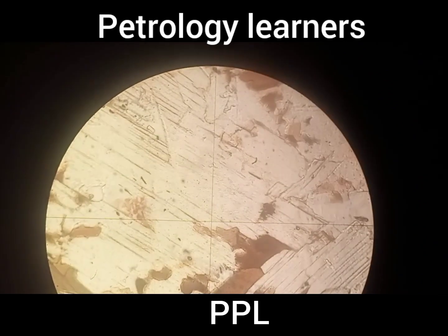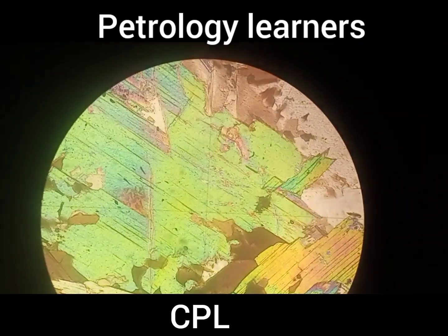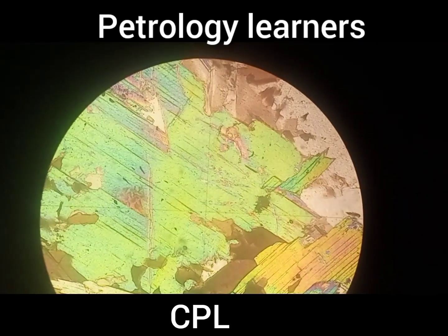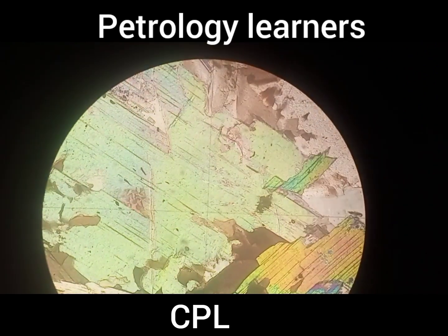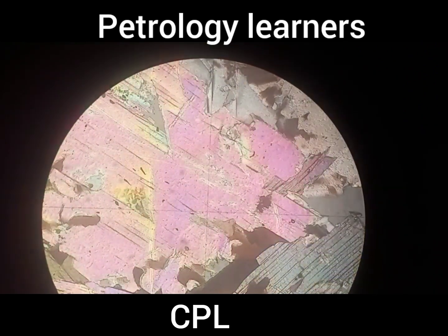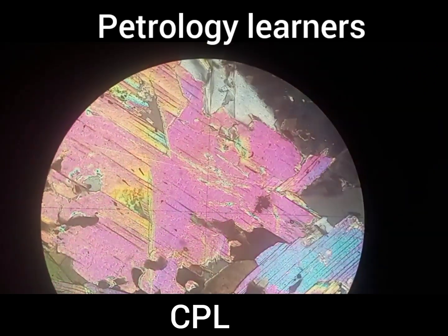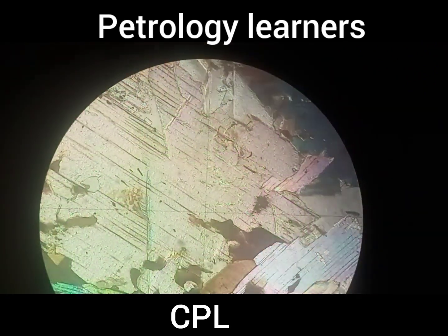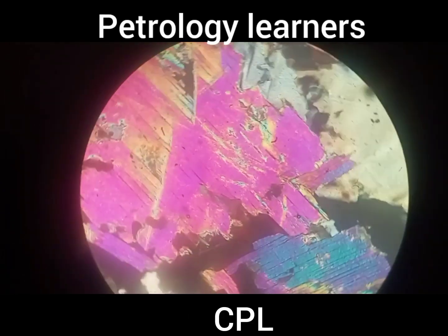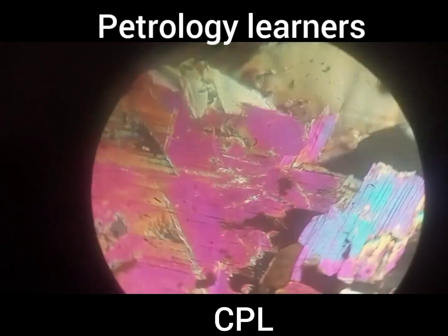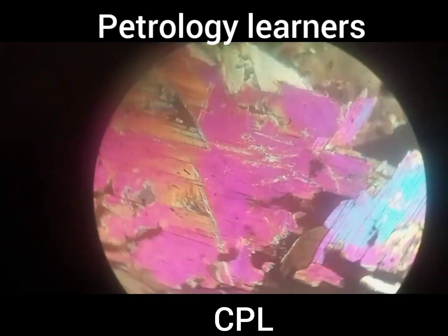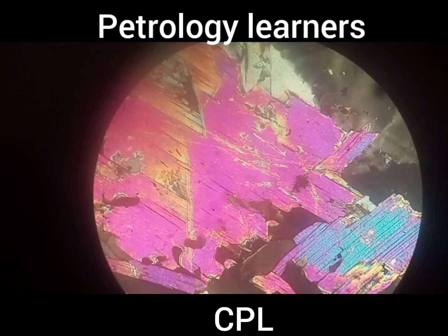In cross polarized light, muscovite is an anisotropic mineral, meaning it changes its color on rotation of the stage — that is known as extinction. The extinction angle of muscovite is from 0 to 3 degrees.